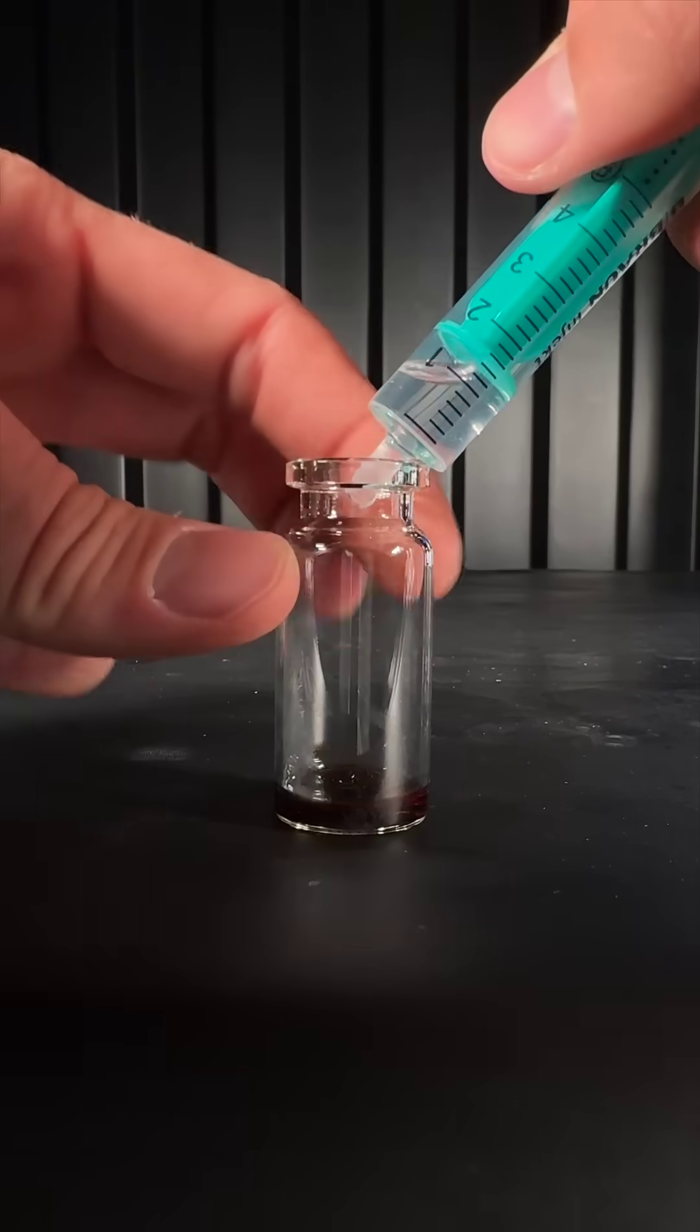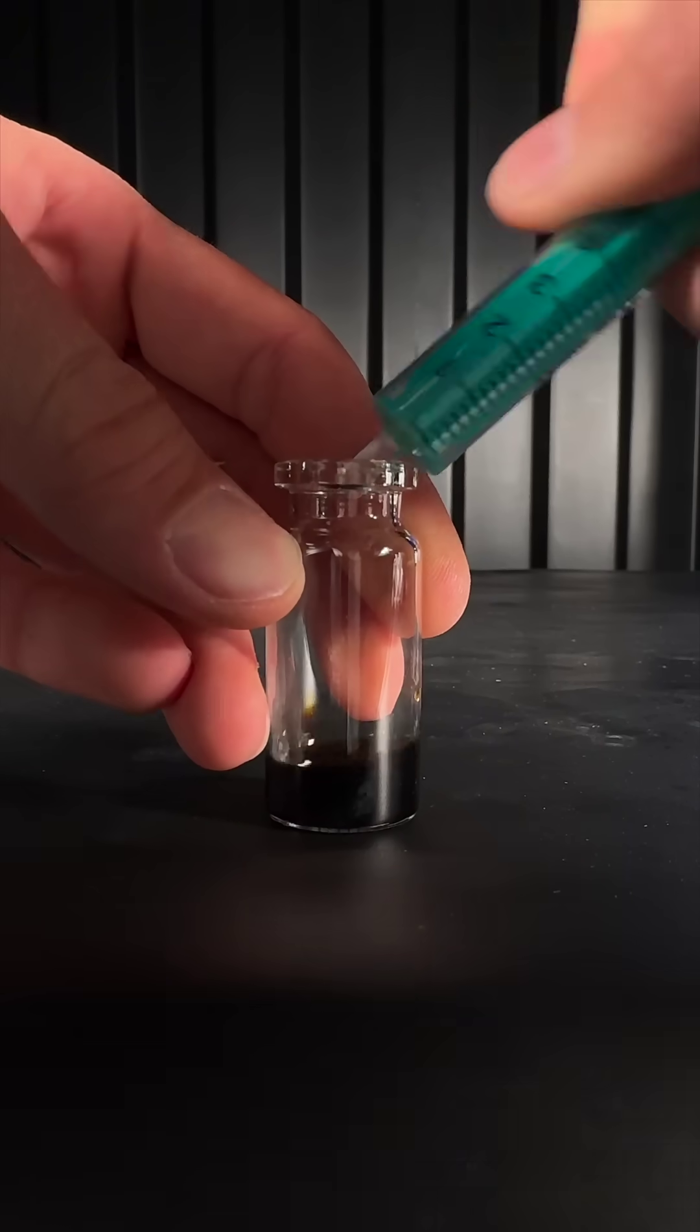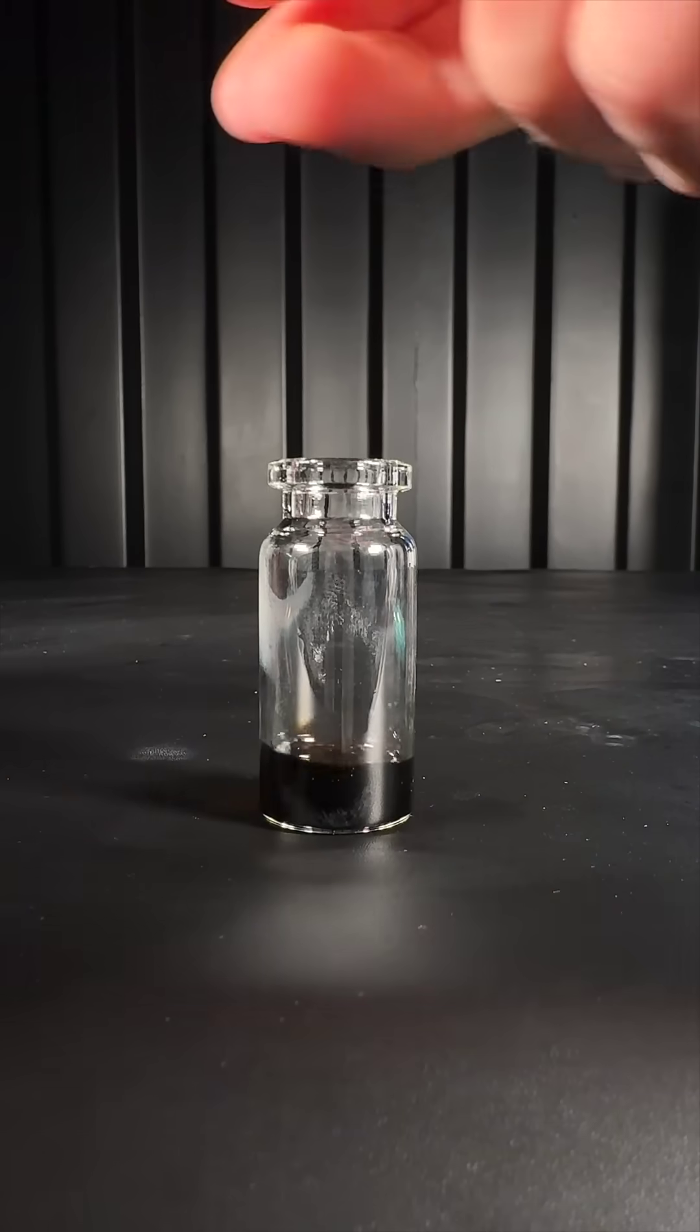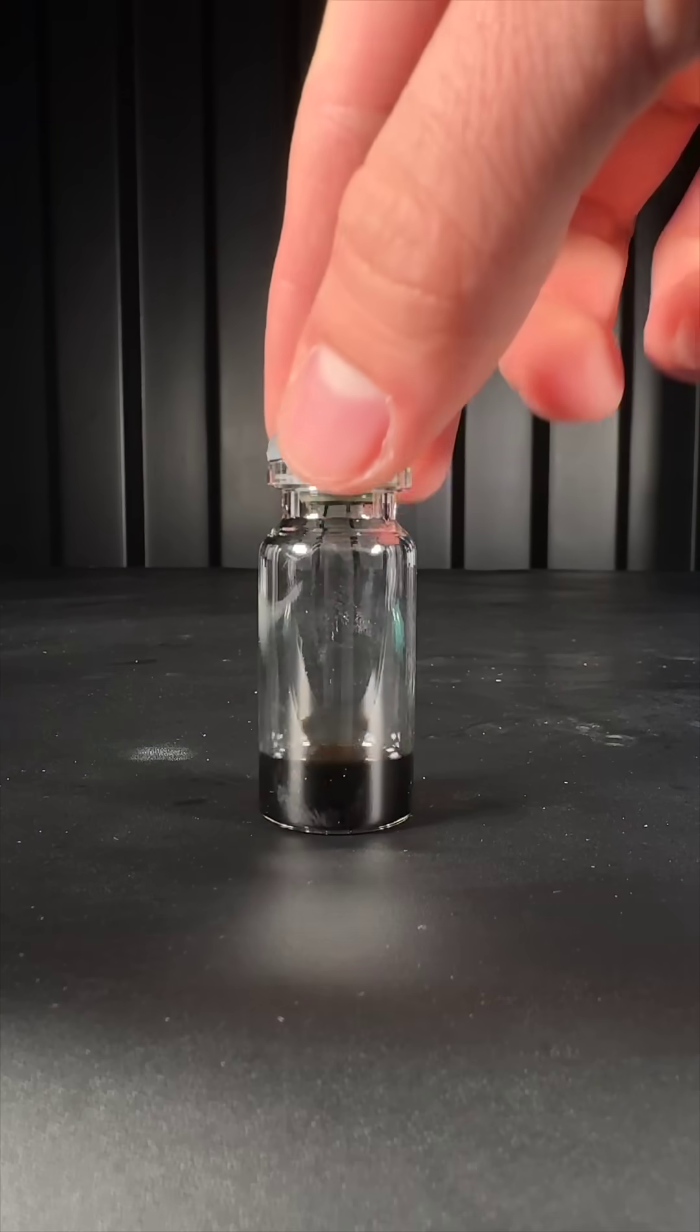The Grignard reagent I am dealing with is supposedly 3 molar methyl magnesium chloride. I dissolved the iodine in a small amount of THF and closed the cap.